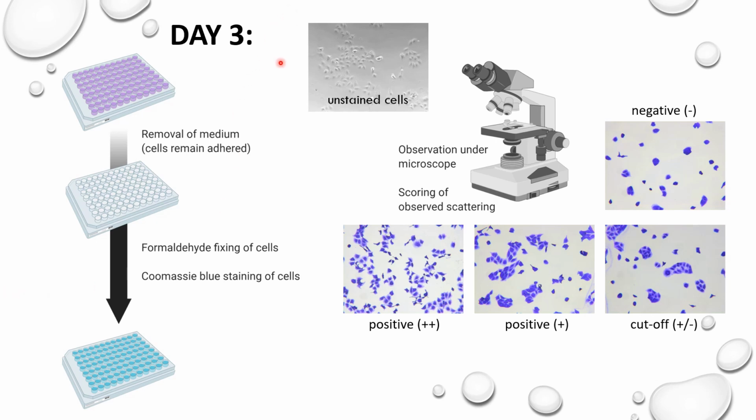Possibly you will see this image, especially when you're on the left side of your row A. You will probably see these very nicely scattered MDCK cells. This also means that you had no uninvited guests in your experiment. There are no bacteria, no yeast, which sometimes are actually very difficult to see because they are tiny. Especially bacteria are not easily seen under this stereo microscope. But you will see the effects on the cells.